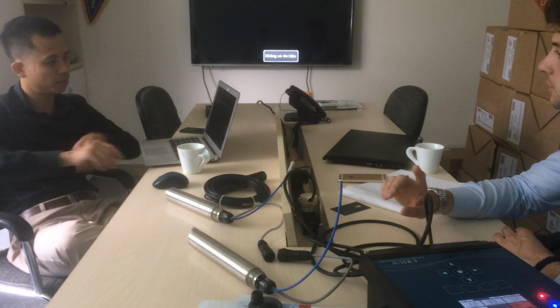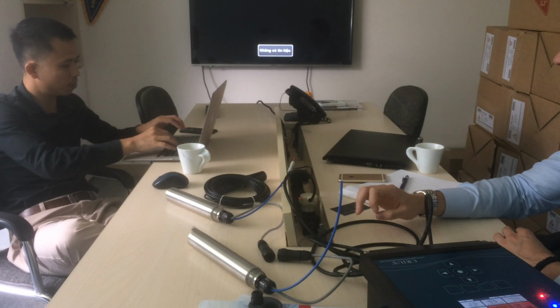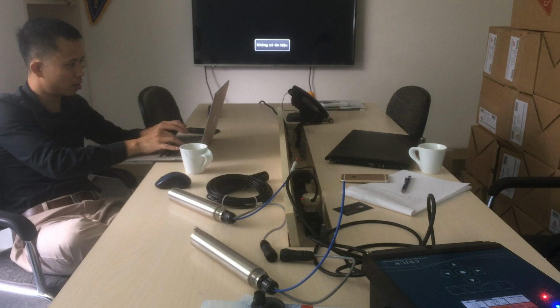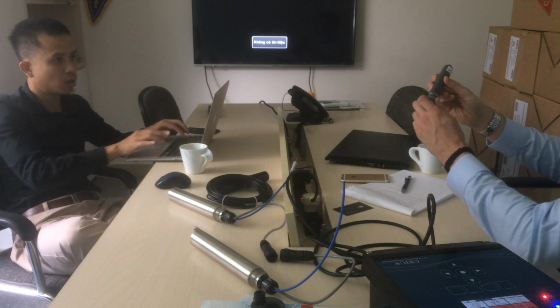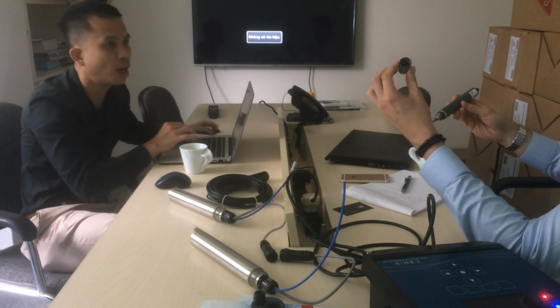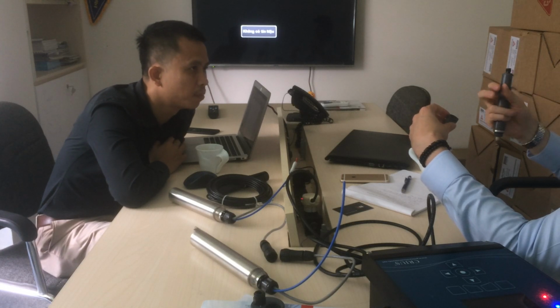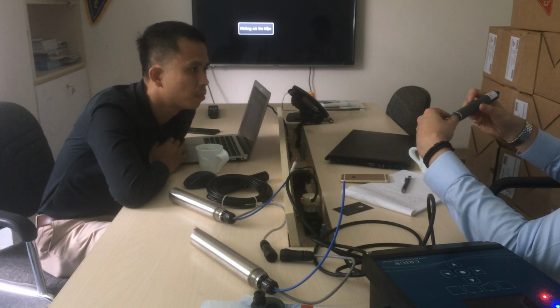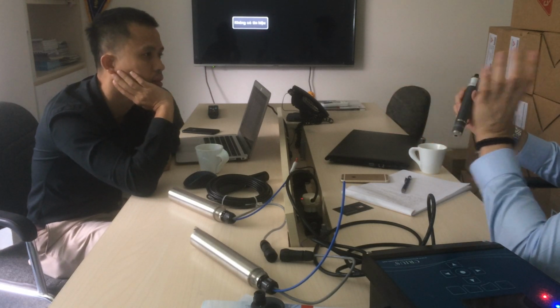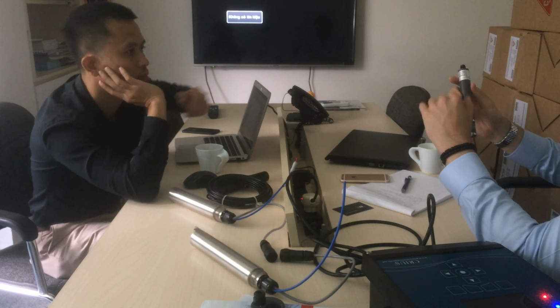The free chlorine has an advantage because it has... I will show you the free chlorine sensor. In here it has a membrane. In here we put electrolyte, and the electrolyte we use is pH independent. So the chlorine sensor is very accurate over a large pH range, which is an advantage of this sensor.